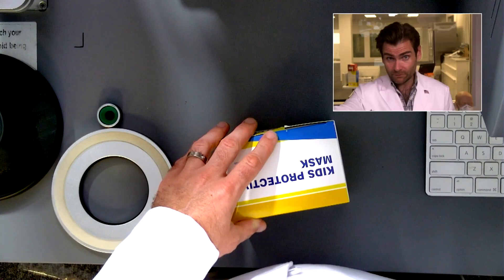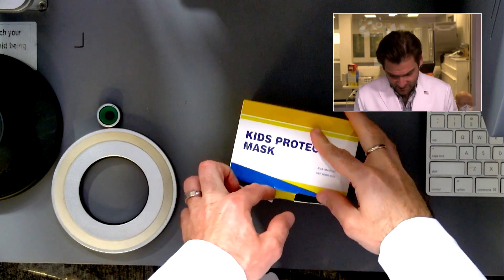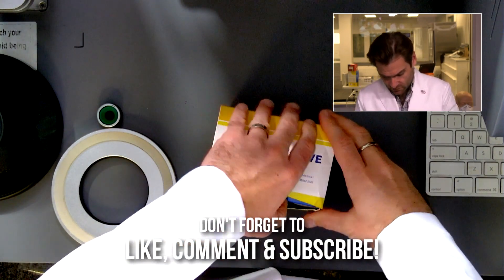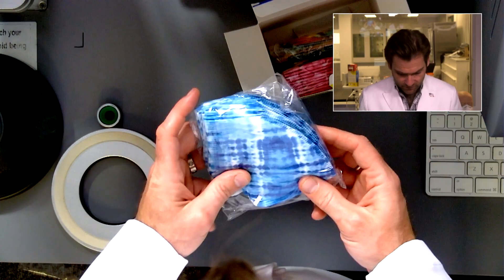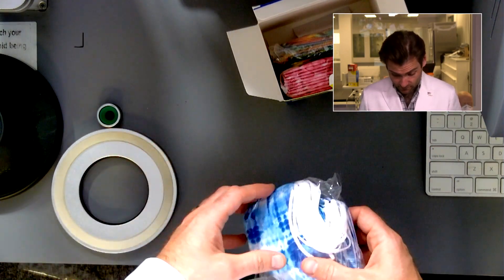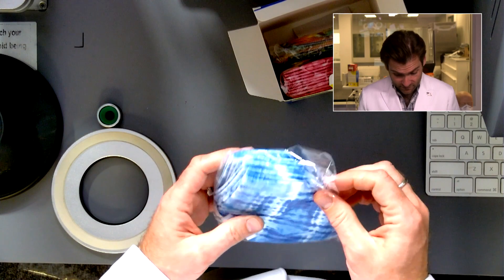Hey everyone, welcome back. We are testing every single mask on Amazon — today we're looking at the Russov kids disposable face mask. Let's put it in the chamber and see what happens. This is using the newly updated Chinese standard, and what's weird is I have tested these before — I swear I've tested this exact same one before.